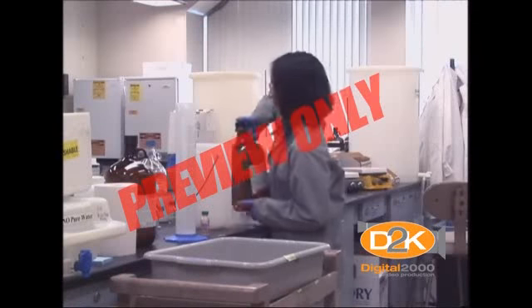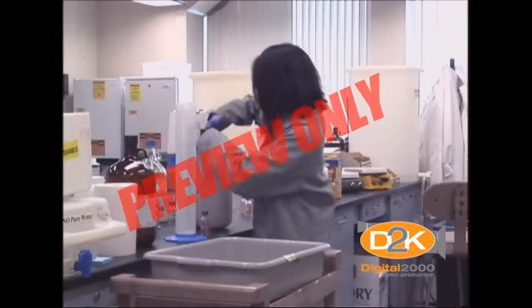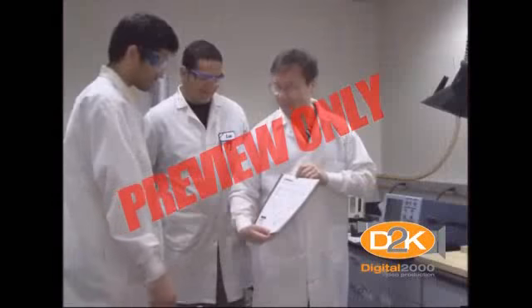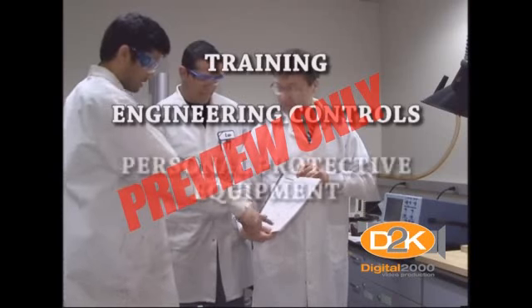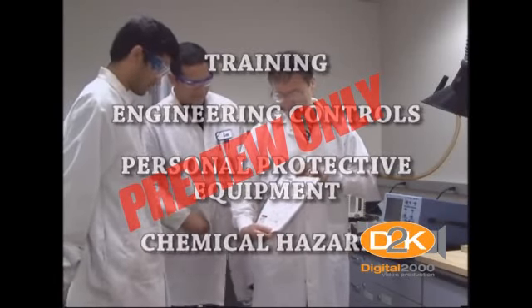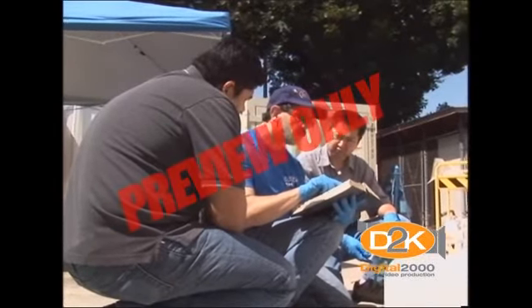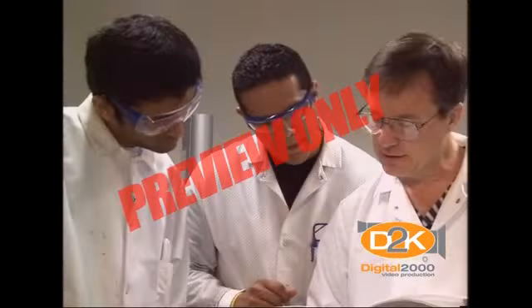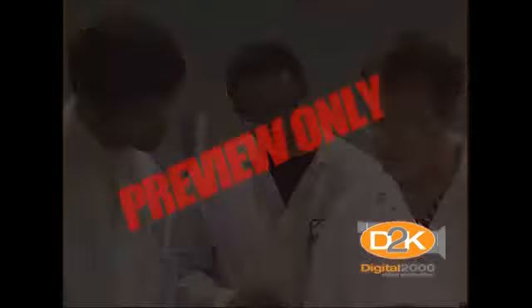In this program, we have covered major components of a chemical hygiene plan specifically for universities. These components included the basics of training, engineering controls, personal protective equipment, and chemical hazards in the university laboratory. We hope that you can use this to stay safe and healthy in your learning environment. If you have any questions, contact your safety department.